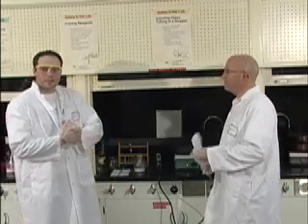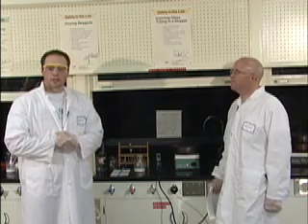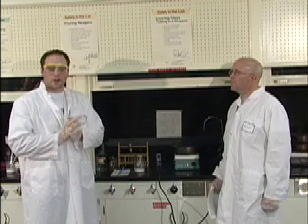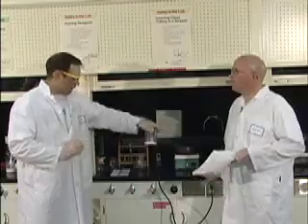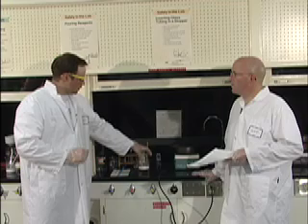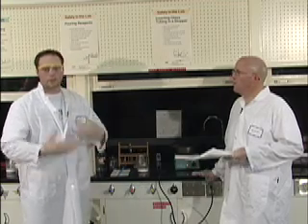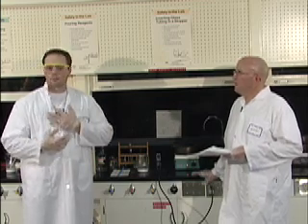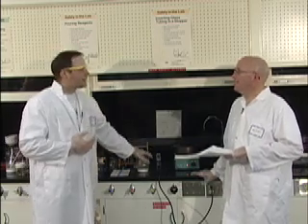Before we get started with this lab, you'll find at your station at the back of the room for Chem 85 there are jars of salicylic acid. Salicylic acid is a white, flaky powder, and it creates a lot of dust when you're scooping it. The one thing you definitely don't want to do with salicylic acid is breathe it in through your lungs. It causes bleeding and things like that on the inside of your lungs, and I would consider that a bad thing. So would I. Yeah, I'm not into that.